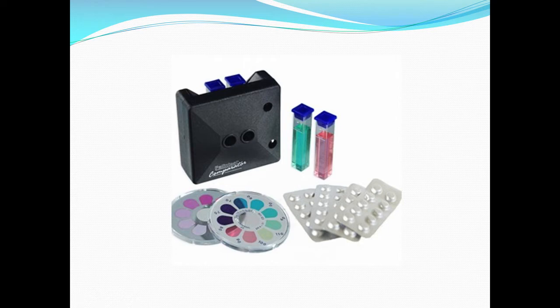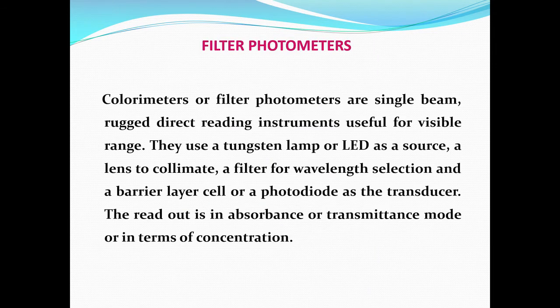The approximate cost of such an analysis would be about 75 to 100 rupees. But if you know more about the scientific things, you can reduce the cost to about 20 to 30 rupees if you know the chemistry of the systems. So, the next higher end is filter photometers.